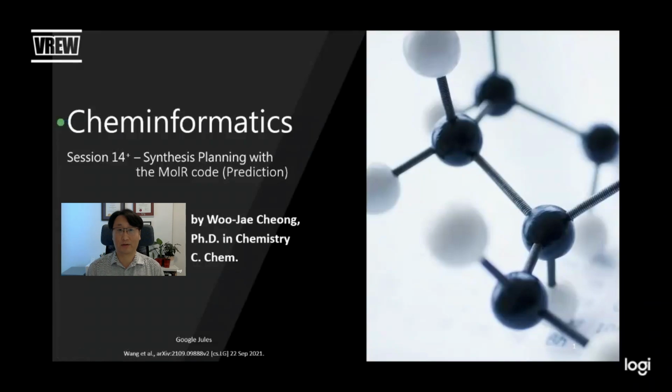Hi everyone. Today we will continue our discussion on cheminformatics. In the previous lesson, we looked at a synthesis planning approach that uses an enhanced graph neural network called chemical reaction aware molecule representation learning. We trained the model using the USPTO 50K dataset.